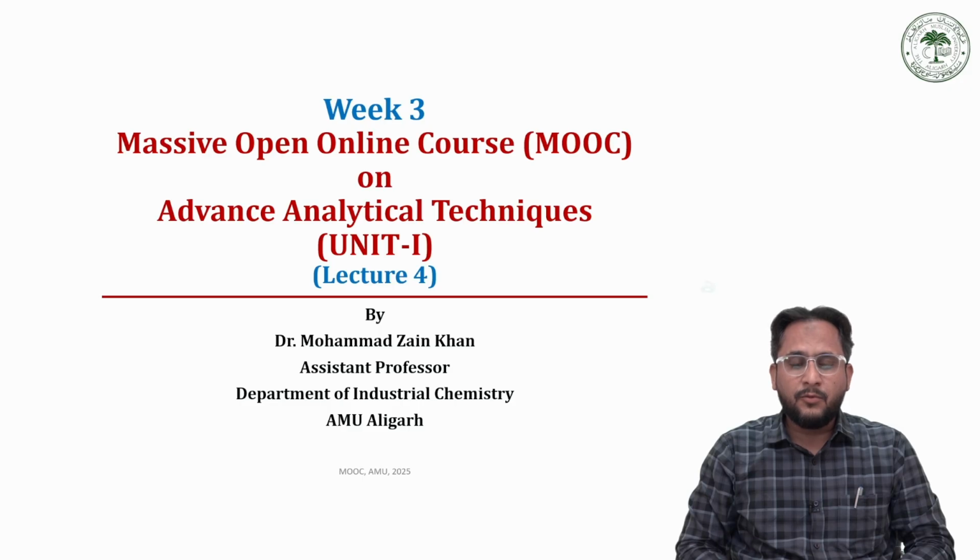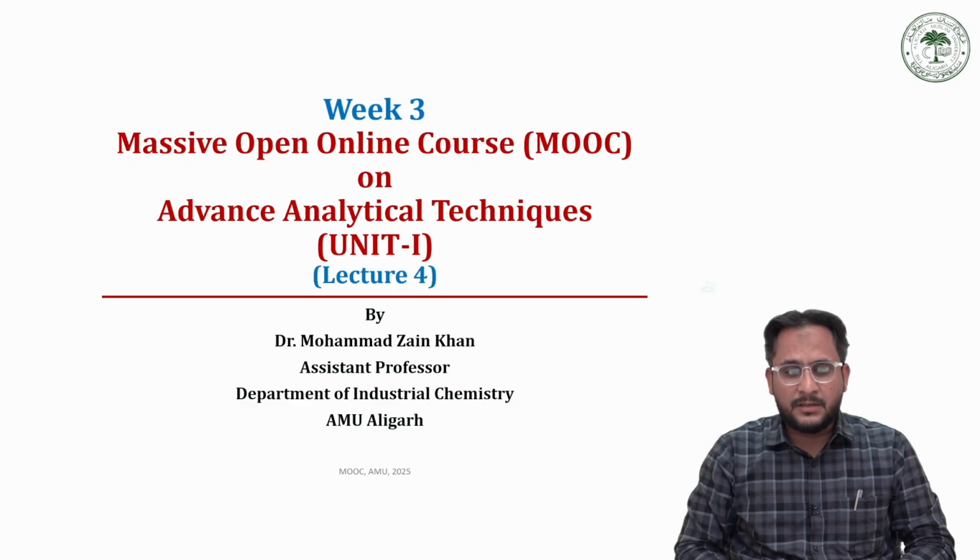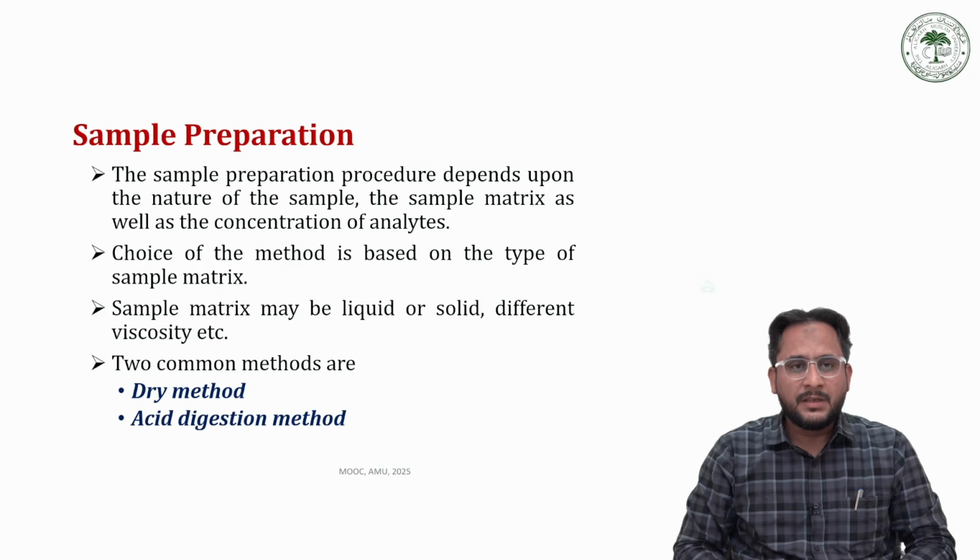Today we are having the fourth lecture of the third week, in which we are going to cover the sample preparation methods of the ICP AES technique as well as the possible interferences, both the spectral as well as the non-spectral interferences that may create some complications in the analysis of the given sample. So let us start this discussion with the method of sample preparation.